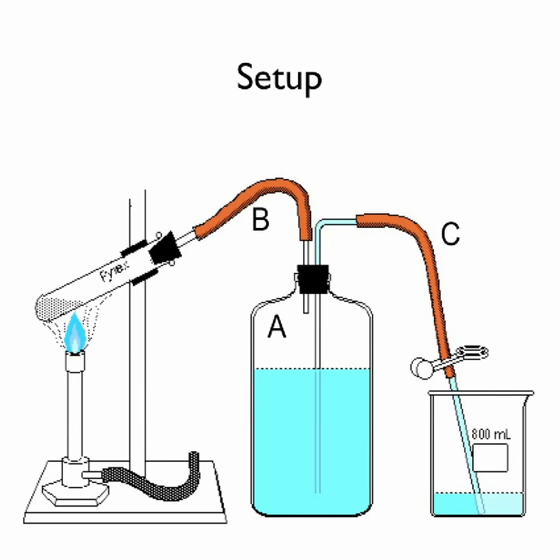Remove the pinch clamp. Raise the beaker until the water level in A and the beaker are even. Close the pinch clamp, and this ensures that the pressure in the ignition tube is equal to the atmospheric pressure, and then empty the beaker and place it on the lab bench. The instructor will demonstrate this procedure. Also, have your instructor inspect your apparatus prior to heating the ignition tube. Once approved by the instructor, you can go ahead and start heating your ignition tube.